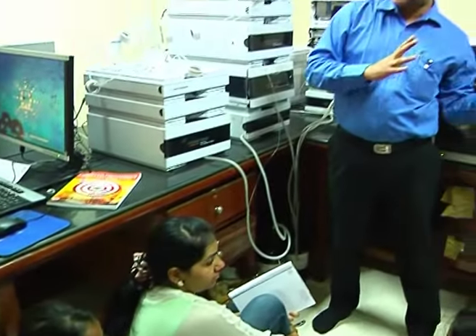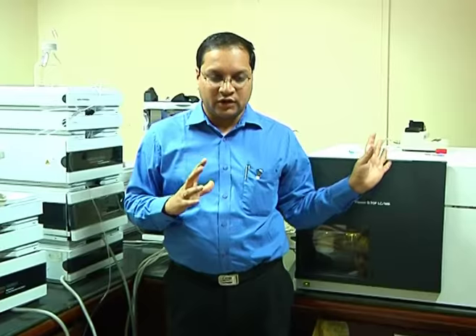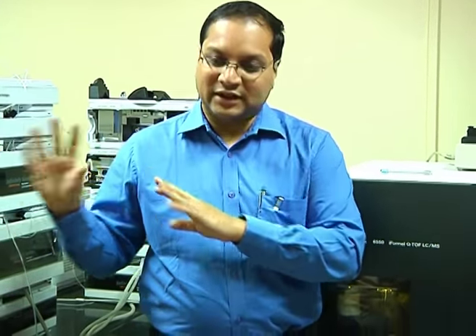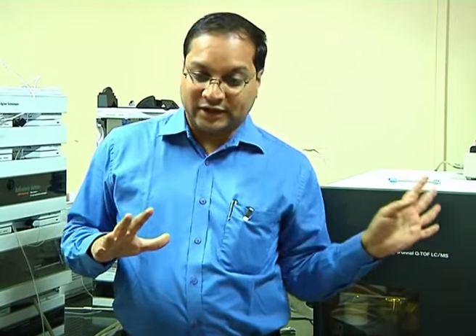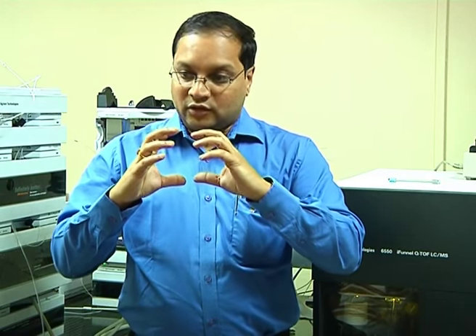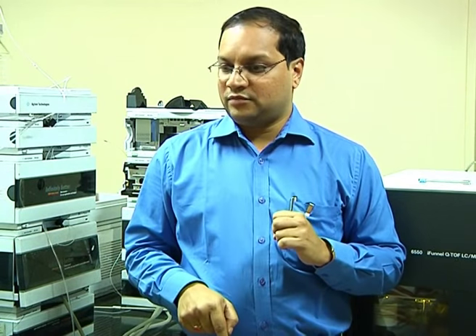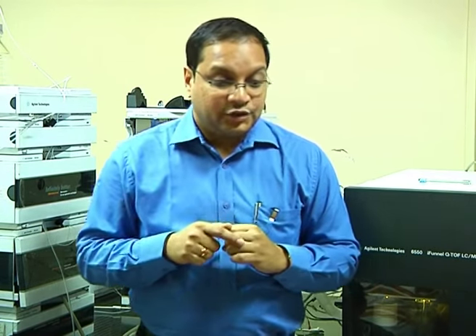Let us first understand in general the functionality, why we use this, and then the applicability. These are very specific questions because you have experience, that's why you are asking. I could sense some experience, but most of you may not have experience. But at least you should know what exactly the quadrupole is doing. So quadrupole is a filter. Okay, it's a mass filter. It's very specific because of that. It is selective, hence sensitive. That's why it is used for targeted analysis.